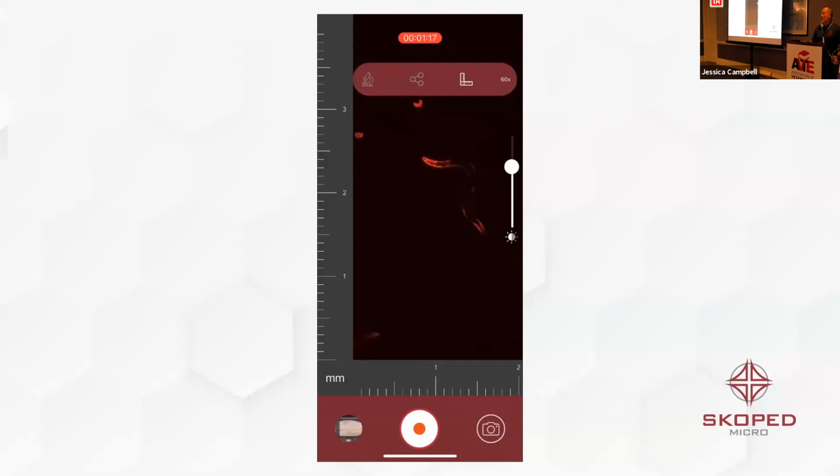And when we set that on there, I'm so glad that I was recording to show, because the gasp of, oh my God, this guy's stuff actually works, was amazing. And it was a little bit overwhelming.